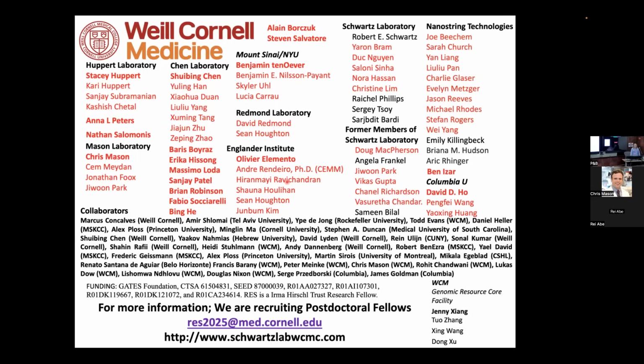Like imaging mass cytometry or MIBI, these are techniques where you label and then you come in and burn an area, and that's what you're assessing by mass spec. So there are 2 costs, in a way. One is in the labeling of the tissue. The other is in the acquisition time, which is at a fixed rate. Then you're really just balancing how heterogeneous you think the tissue is in order to get enough power to comment on what the differences are, or how heterogeneous the tissue is, so you can capture all the cells. And that's just a judgment call right now.